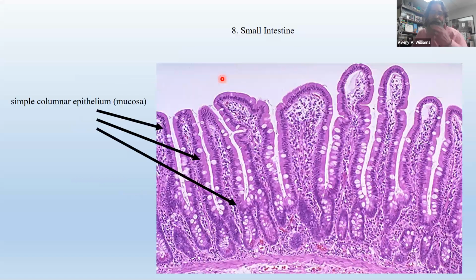So we'll zoom in on that. So here we are, zoomed in. This is like 500 times looking at the intestinal mucosa. I just have mucosa in parentheses. And these are individual villi. See, coming up like this, these little finger-like things sticking up. And they're lined with simple columnar epithelium. If you look carefully, remember I told you columnar cells have to have that vertical orientation?